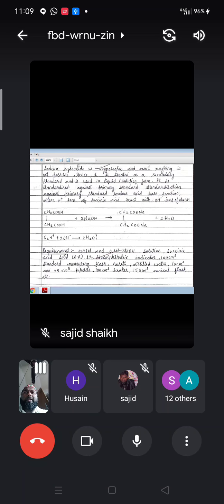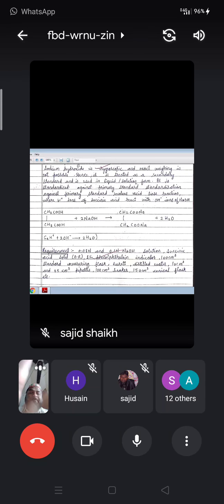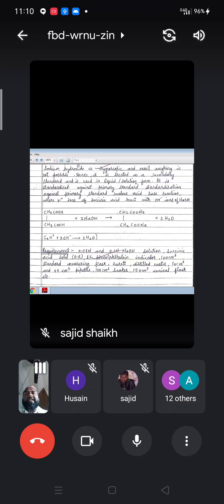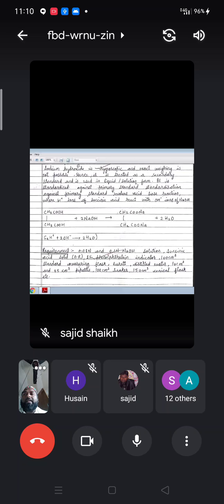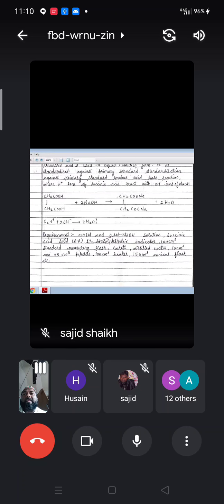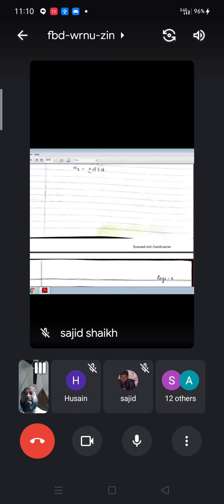The two different concentrations of NaOH provided are approximately 0.08 and 0.1 normal NaOH, which we have to standardize. Other required materials include: succinic acid in solid form (AR grade), phenolphthalein indicator, 100 cm³ standard measuring flask, burette, distilled water, 10 cm³ and 25 cm³ pipettes, 100 cm³ beaker, 150 cm³ conical flask, and so on.